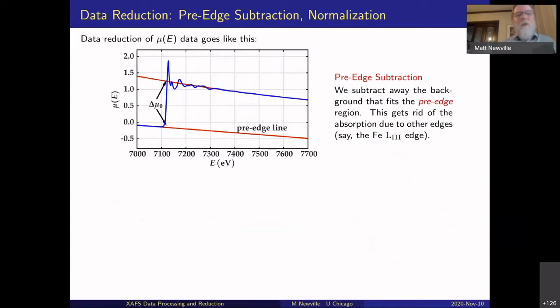Okay, so once we have that, this data set is probably just a different measure of iron oxide because these values are different. They go from slightly below 0. How can it be below 0? Well, it's a log, so the values are just less when we divide them by each other.